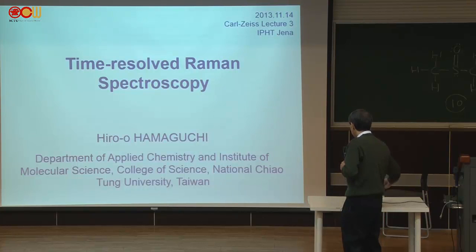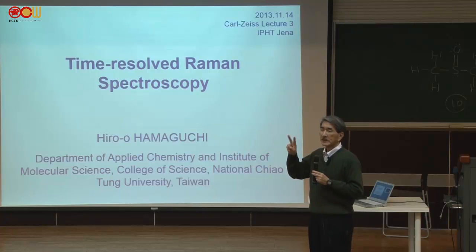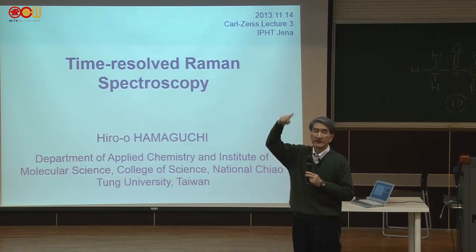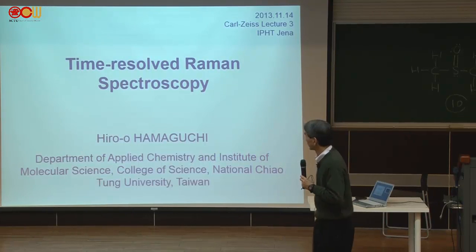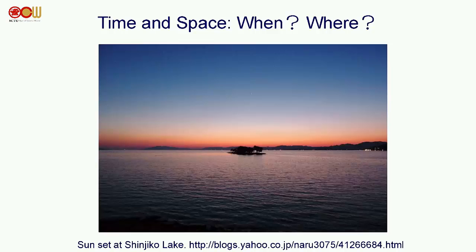So what is time-resolved Raman? And as I said, we use 2 lasers. One is a pumping laser to excite the molecule into the excited state, and the other is a probe laser to see what's going on in the excited state of the molecule. So I first show this one.